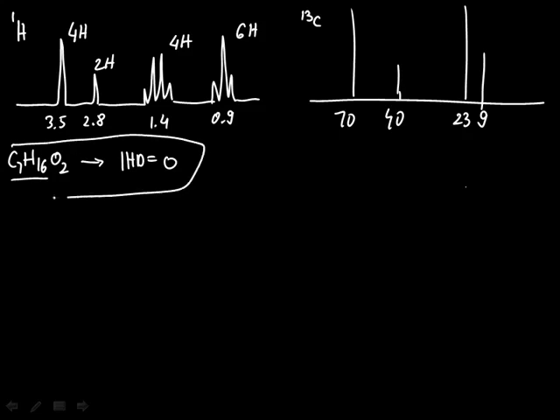Now looking back to this structure, we see 6 hydrogens here, and this will very likely be a collection of 2 methyl groups. Now if they're really methyl groups, and if they have neighbors, they should be splitting those neighbors into quartets according to the n+1 rule. And indeed we see that, so this is sort of semi-confirmed. These are 2 equivalent methyl groups, and they're splitting this neighbor into 4.